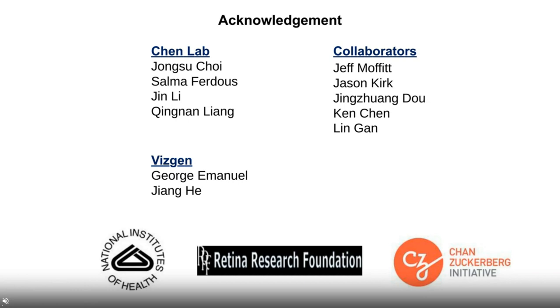I can also add a little bit, because lncRNA and non-coding RNA have actually been profiled by MERFISH technology in the past. There has been a demonstration of MERFISH imaging more than 10,000 genes in cells, and in that research paper, non-coding RNAs were actually included, and they were able to identify quite a number of those non-coding RNAs enriched in different organelles or the nucleus. Okay, thank you. Next question.